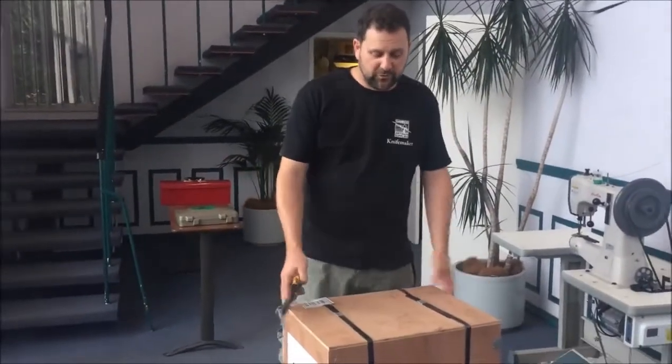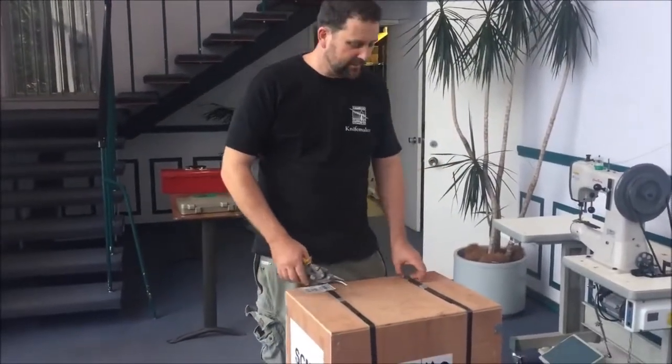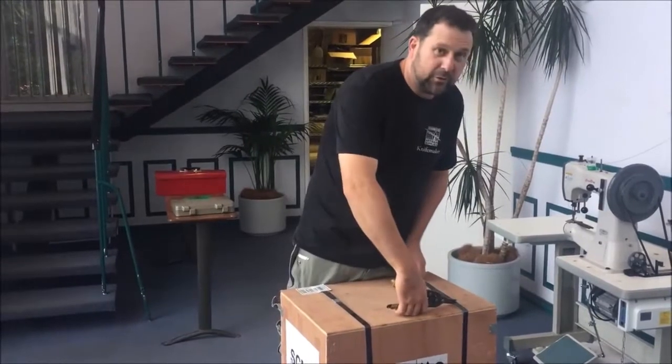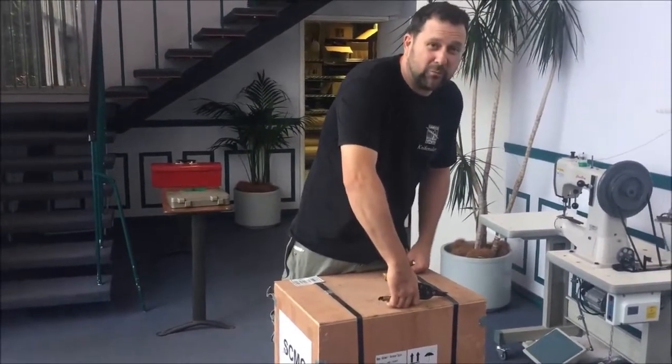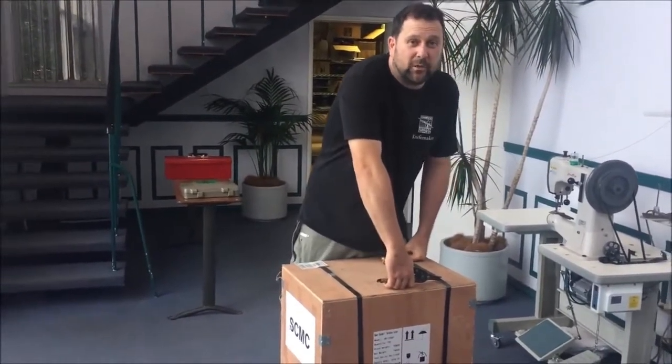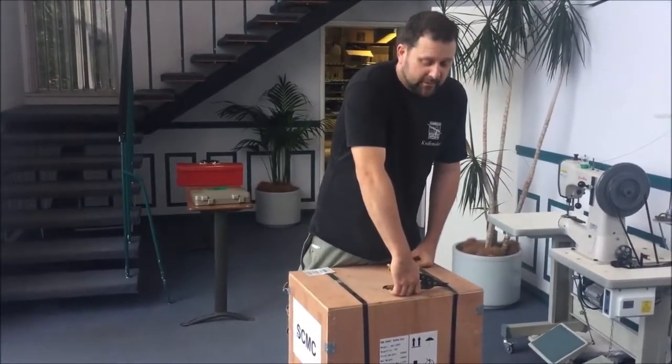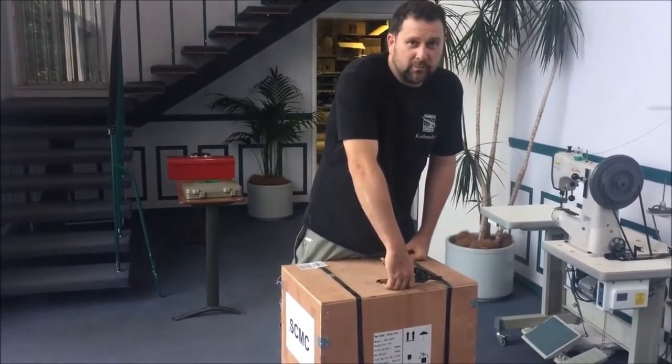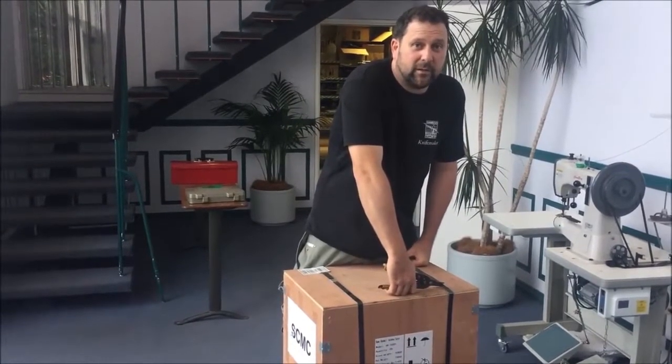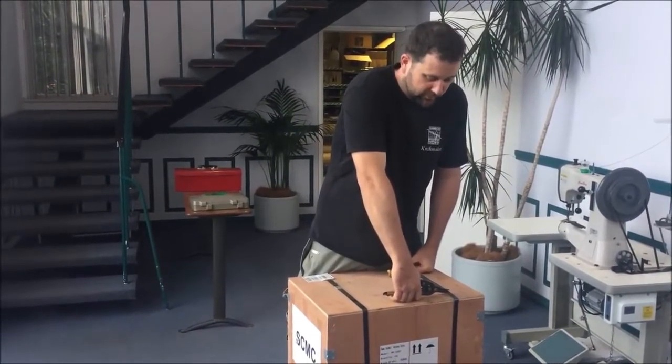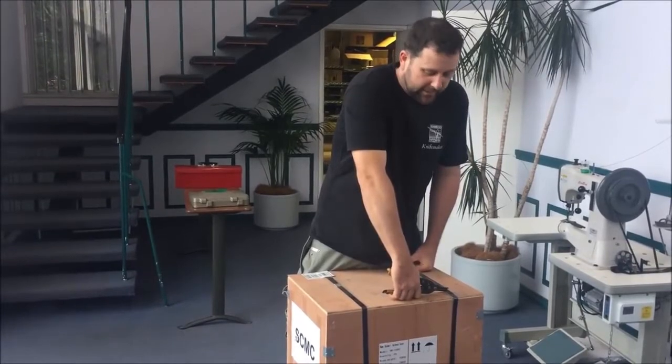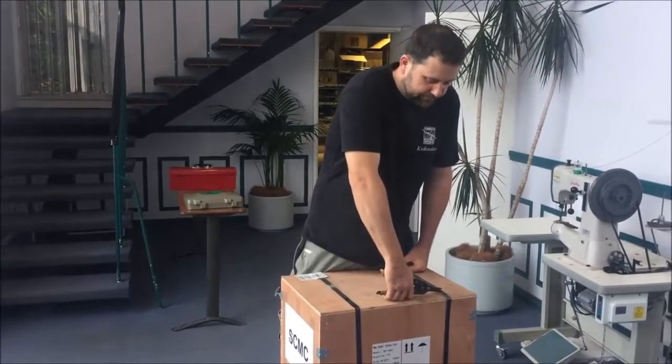Hi, thank you for purchasing a Gamko Hardness Tester, particularly if you got in on the bulk buy. Follow us on Facebook on bulk buys and clearance sales from Gamko Hardness and Supplies to get in on good deals like this. We're going to unbox one and set it up so that you'll have a bit of an idea what you're in for when they arrive and you'll be able to set yours up.